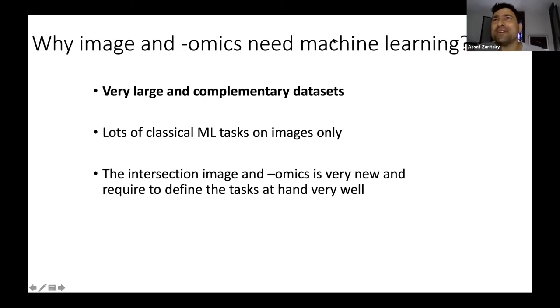I don't know, but maybe. I mean, you saw that in, for example, the segmentation competitions, right? They came out with three or four major papers with new ideas on how to segment the cells. So this is going from computer science to biology. The other way around, there are not many examples, but UNET is like the best.